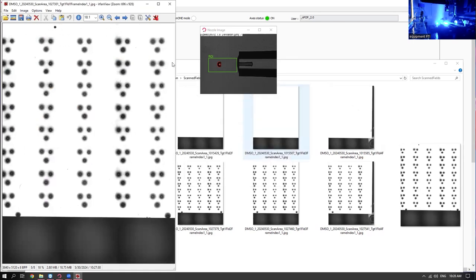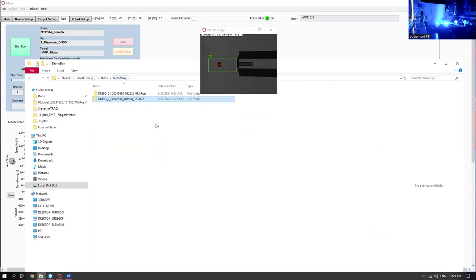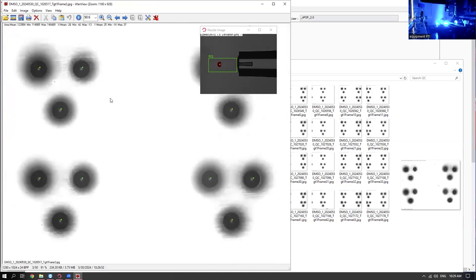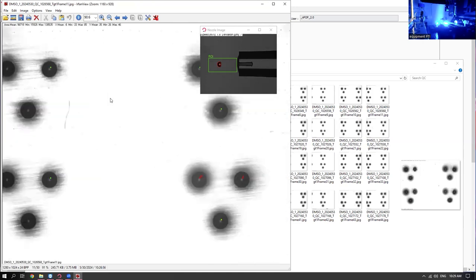There was a step at the very beginning where we performed a QC analysis of where these droplets were. Because of the evaporation or condensation around the outside, the position of this dot is where the robot was trying to put the drop. And so that's where we're going to put the cell, and where we're going to put all the other reagents. If we were to have any sort of issues with stability, we would see it here.